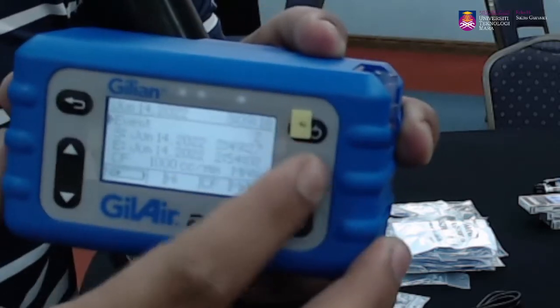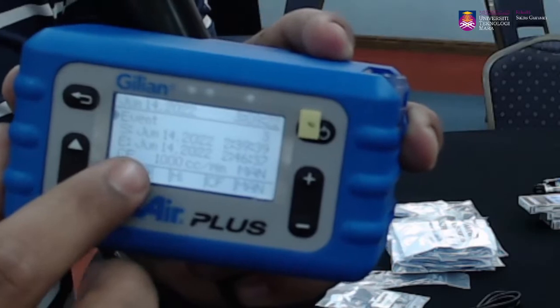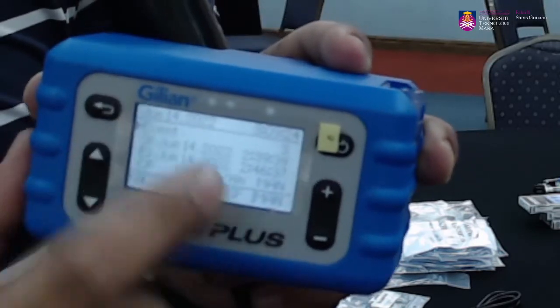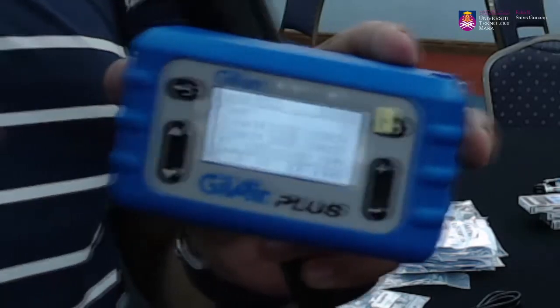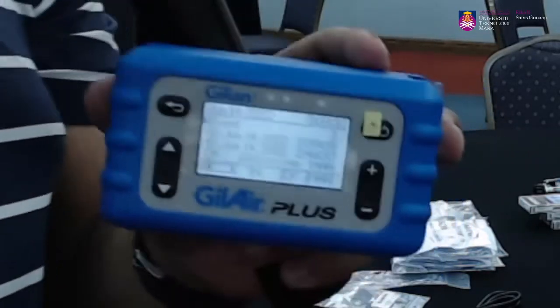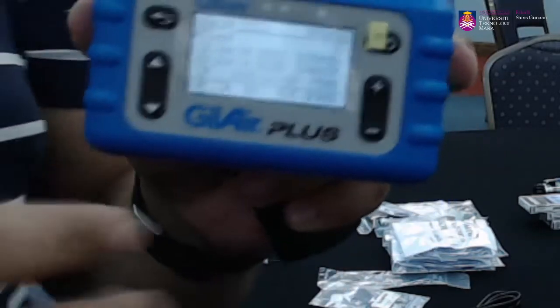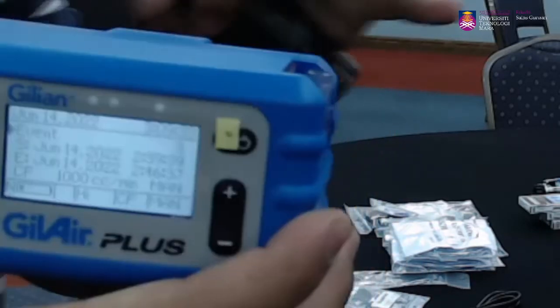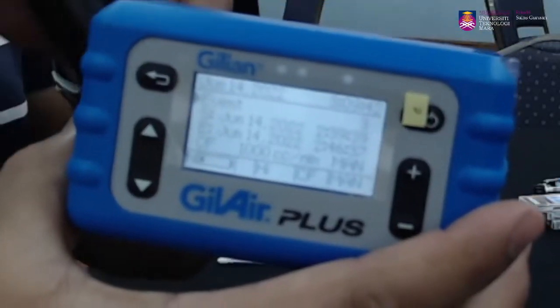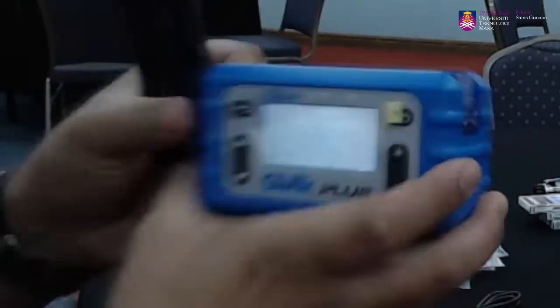So kalau kita nak scroll through and the last one, kita tengok in terms of 1000 cc per minute, and then dia akan bagi in terms of date and time juga. So daripada situ kita tahu in terms of berapa runtime kita, and kalau kita nak betul-betul tengok berapa flow rate dia, maintain ke apa, kita boleh go through the apps lah. Daripada situ dia akan bagi in terms of 3 reviews juga, and then kita boleh tengok macam mana runtime of total 3 lah. Okay.